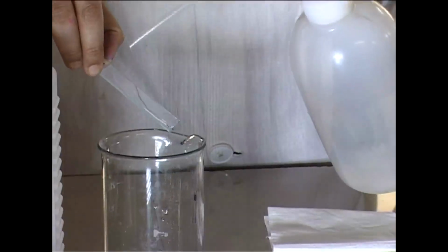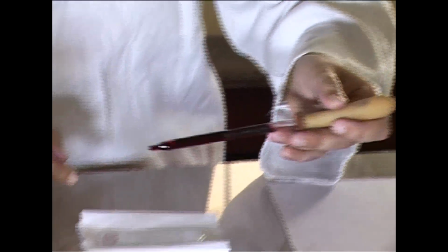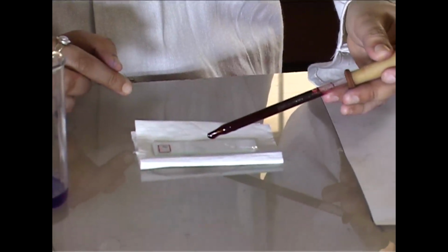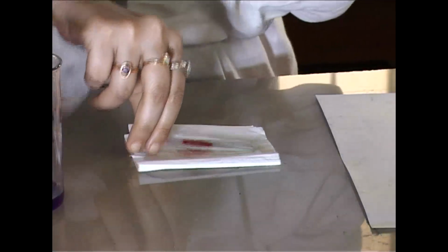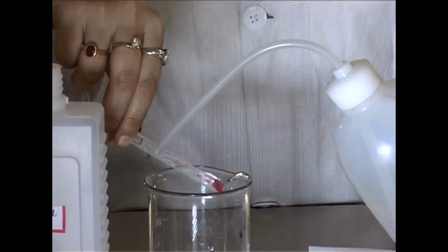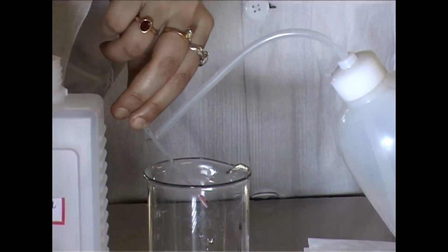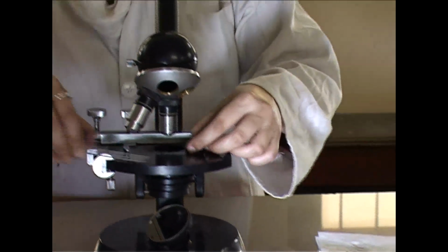Then it is washed with distilled water, and then the smear is counterstained with safranin and kept for 30 seconds. After 30 seconds, the excess safranin is washed with distilled water. The smear is air dried and visualized under the compound microscope.